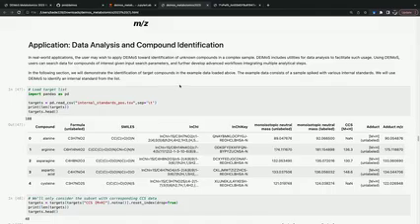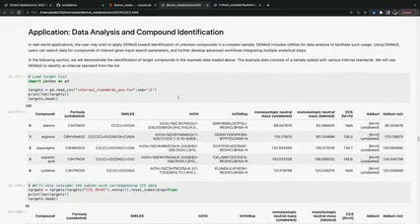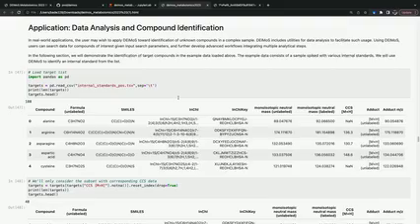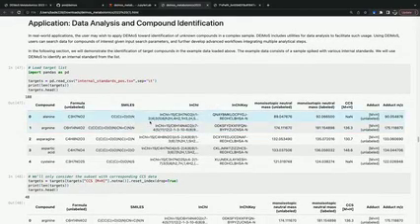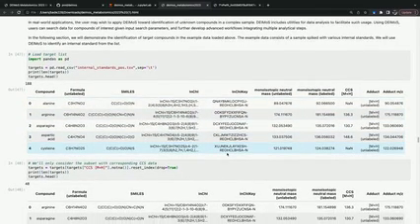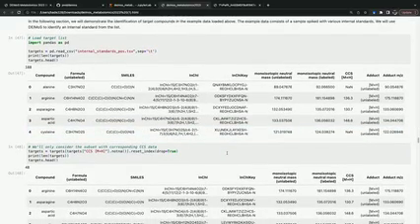In this application section, we're demonstrating that with an included list of standards that are spiked into our data. The composition of our data is actually a real plasma sample that's been spiked with various internal standards. We have a list of those standards in this internal standards file, and that includes information such as compound identifiers, and also information on the adduct m/z, and for some of them, the expected CCS. Here we're going to demonstrate how to identify some compounds in this list, in the included data via DEIMoS.